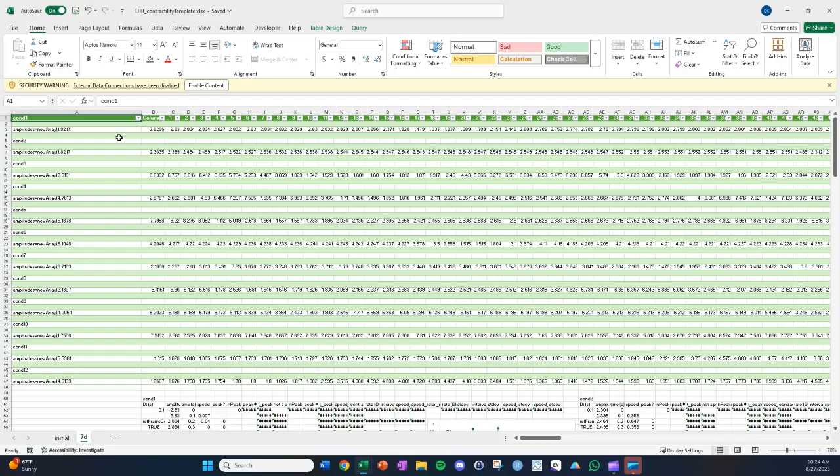Alright, welcome. This is part 2 of 2 in my protocol for contractility analysis in tissue. You'll need two things to do this next part of the analysis. The first is this file, which I'm calling a template Excel file, opened. And the second thing is the data that MYOCYTER outputs.